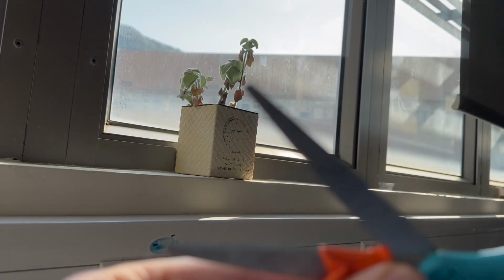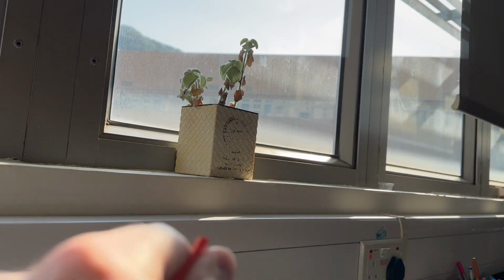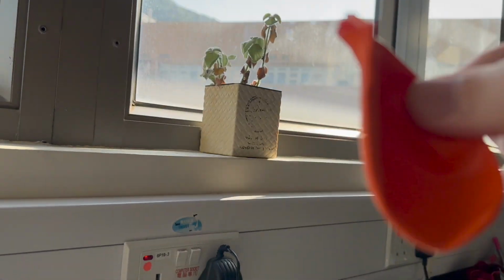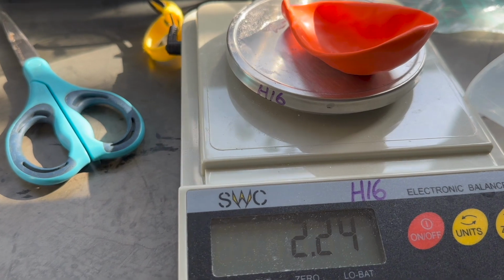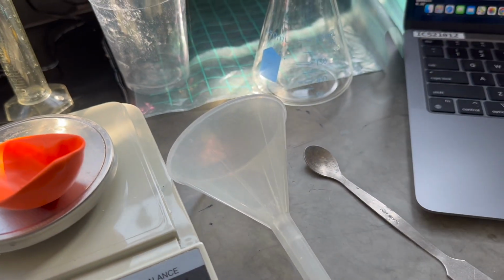So let's cut it right here so it will fit over the flask better. Okay, now that I've cut it, I will check the mass. So mass of balloon, 2.24 grams.